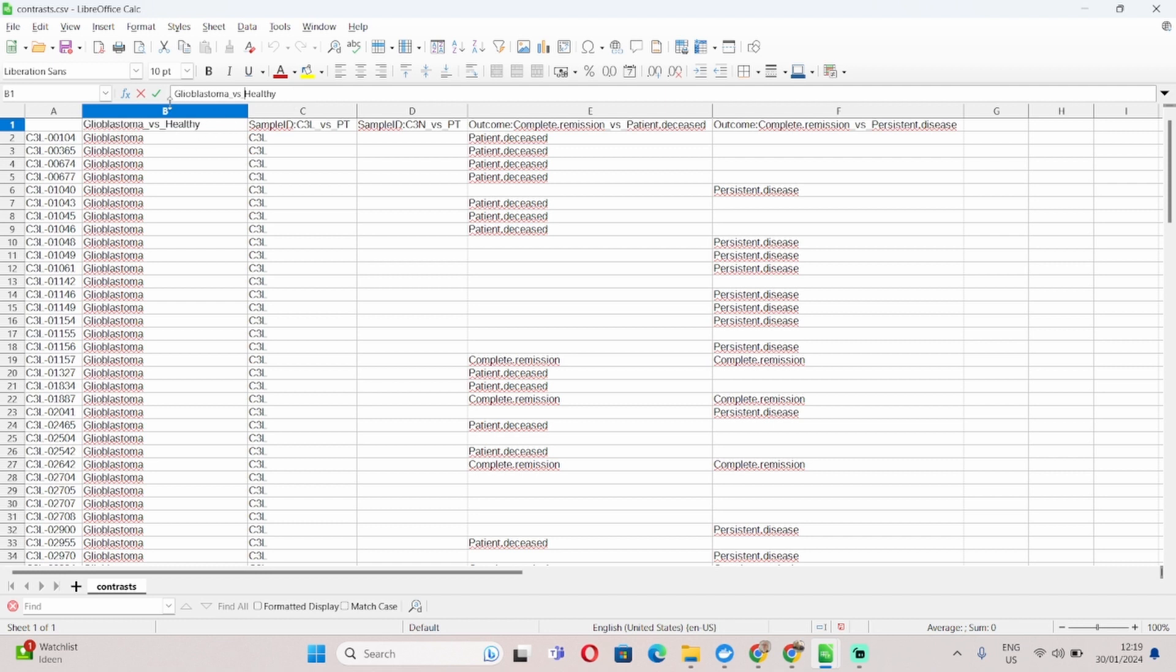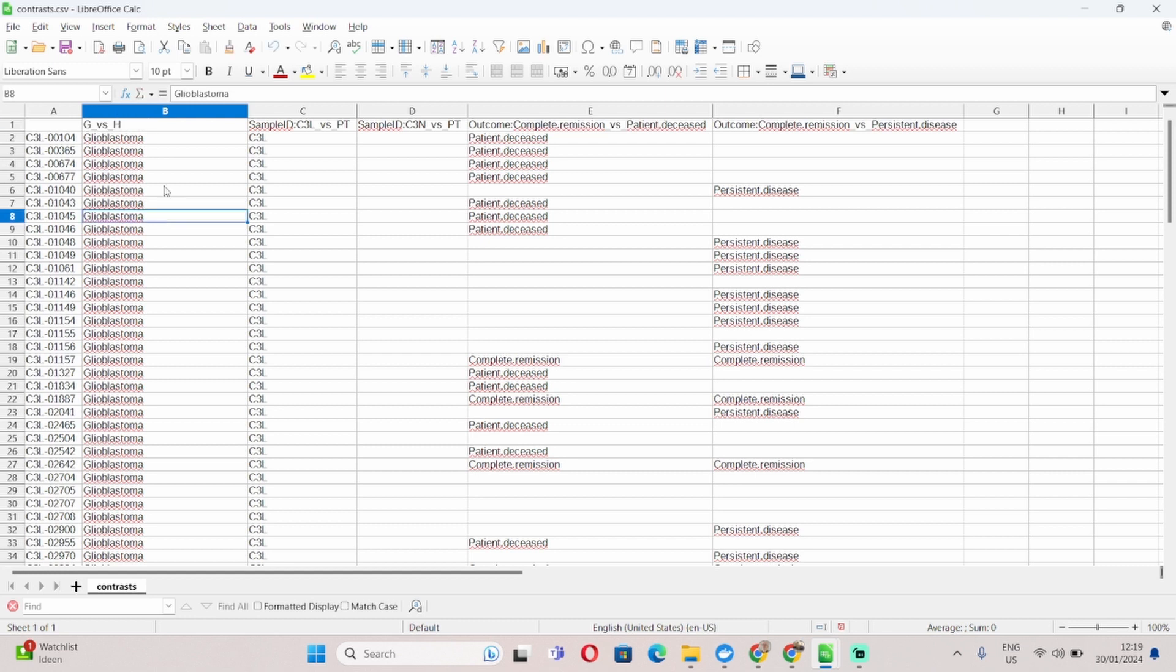Otherwise, you can name the rest of the pairwise comparison any way you want. So I could for example change this to G versus H. And that's absolutely fine with the platform, as long as it contains this element here, underscore versus underscore.